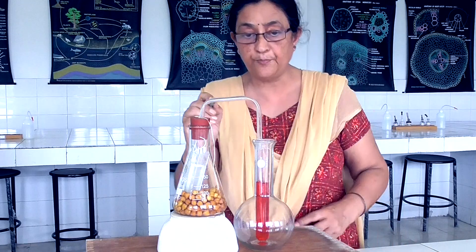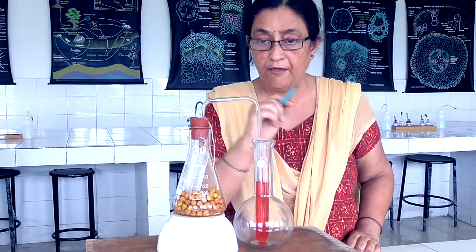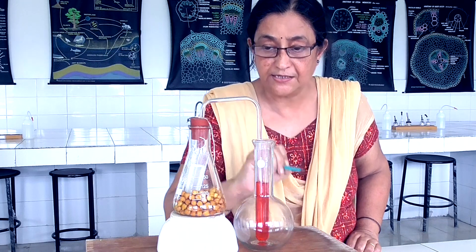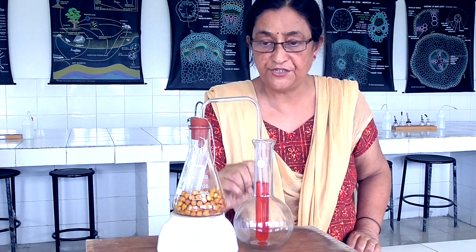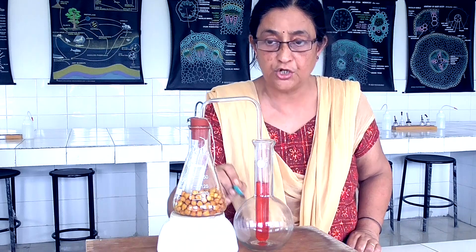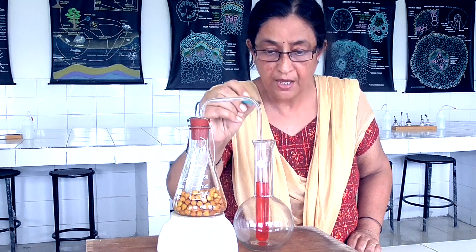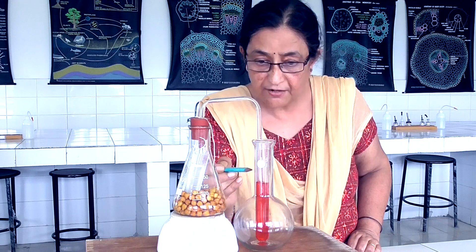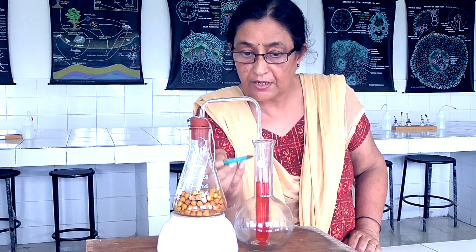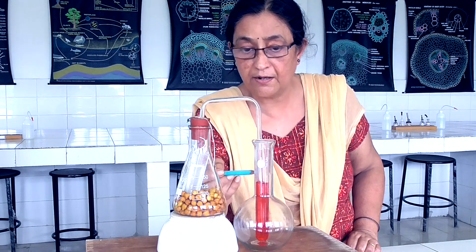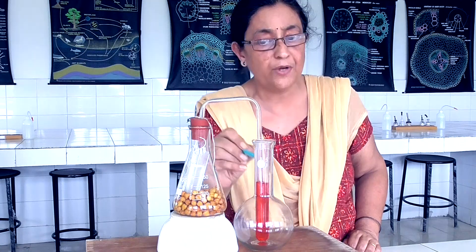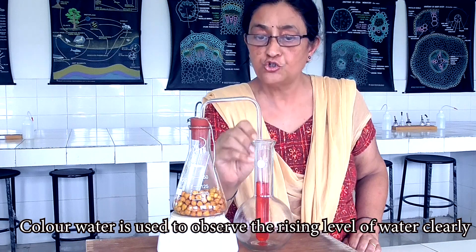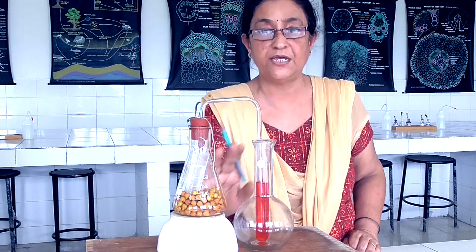Now we are going to start with the procedure, observation, and conclusion. You have seen these are the germinating seeds; you can see the potassium hydroxide solution. Now this is the delivery tube which is dipped into colored water. Why do we take colored water? So that we can easily observe the level of water in the delivery tube — if it is not colored, it becomes difficult to see. You can color it with ink or safranin dye.